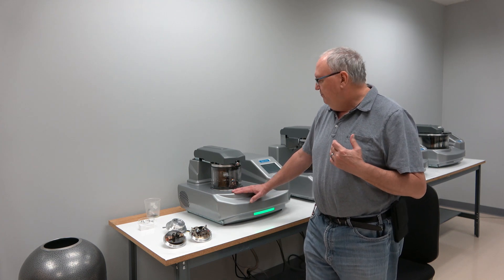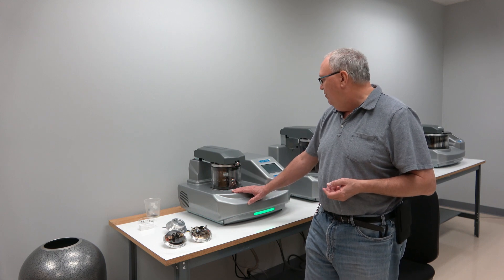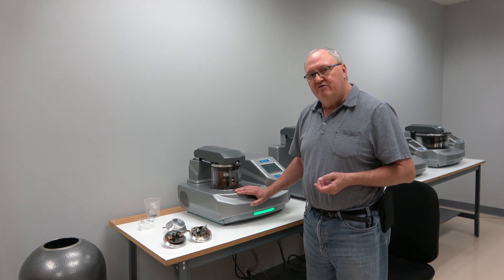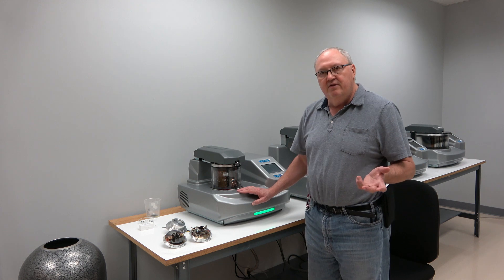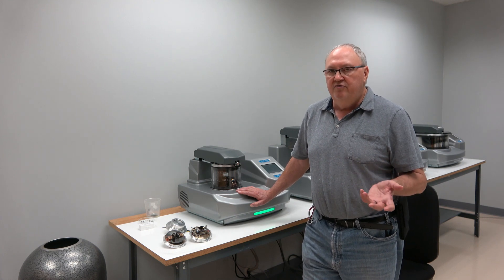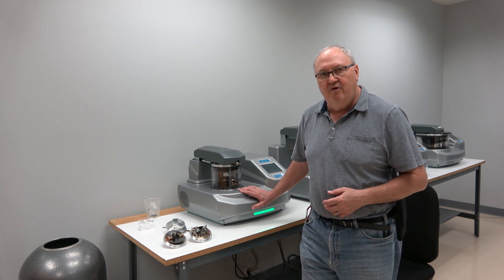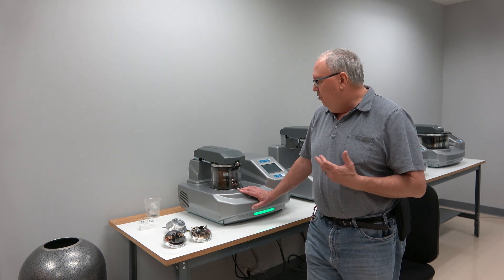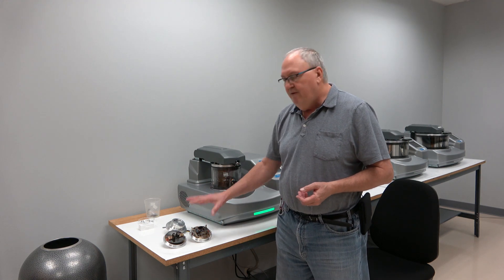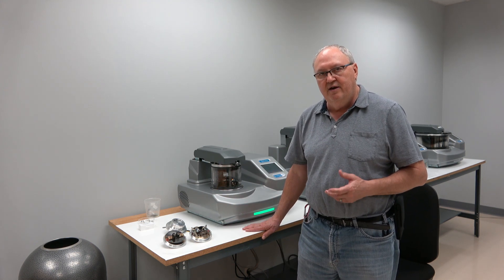The 150 VS Plus will pump to 10⁻⁶ in about an hour. My demo system here, which I try to keep as pristine as possible, has pumped overnight to 4×10⁻⁷ millibar — quite remarkable for a benchtop system without using any liquid nitrogen as a cold trap. It has a very specially designed pumping manifold that Quorum developed. These are some of the inserts that are common to all those systems, and I will talk about those in a moment separately.